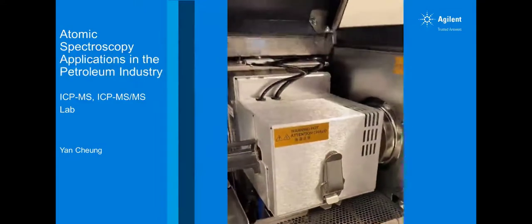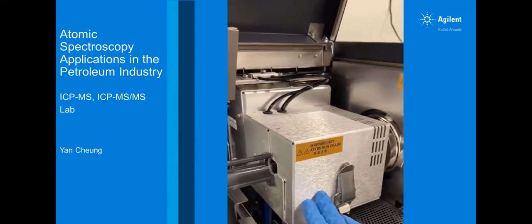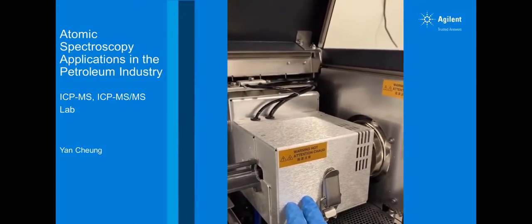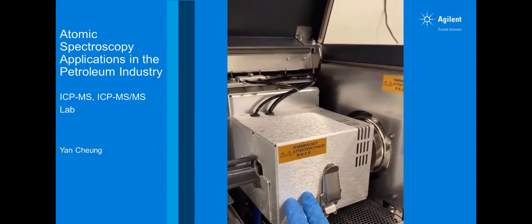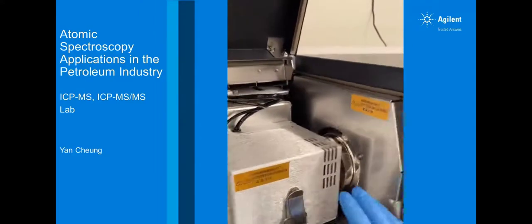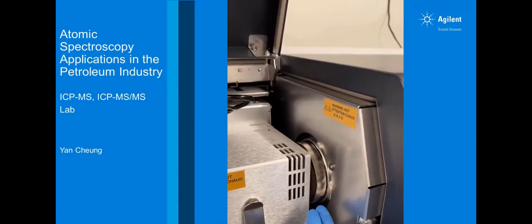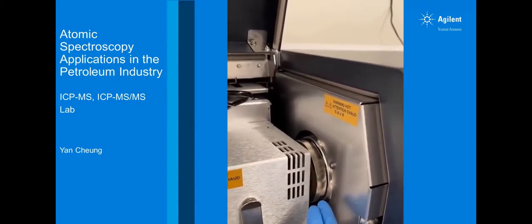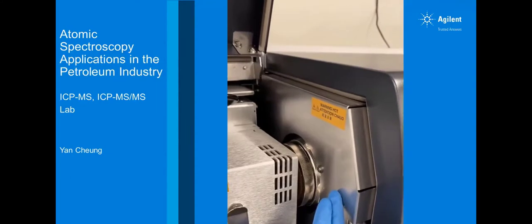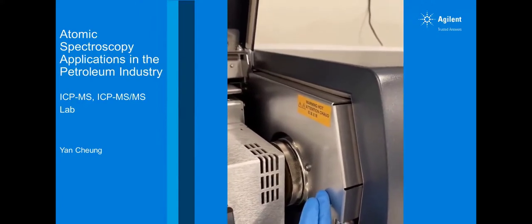Okay, with the torch, we will recommend to use a torch with a smaller injector inner diameter, so it's a 1 millimeter inner diameter injector torch. That is to limit the amount of organic solvents to reach the plasma to avoid solvent loading of the plasma. For the cones, for sampling cone and skimmer cone, we recommend to use platinum tip cones. That is to withstand the higher temperature of the organic plasma. In terms of the lens, we will recommend to use the brass base lens base for the extraction lens.